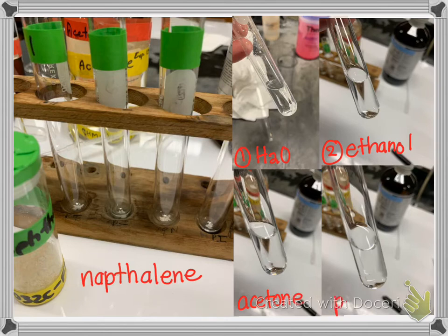And this is with petroleum ether. Now looking, it was hard for me to get a picture, but there's white solid in there. This is the only one that had white solid. The other ones did not have any solid left.